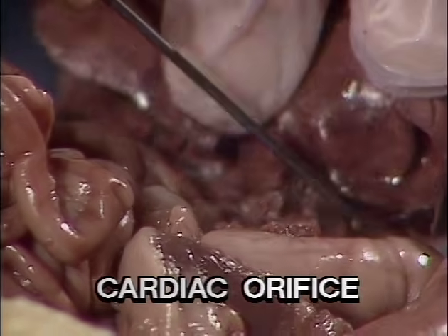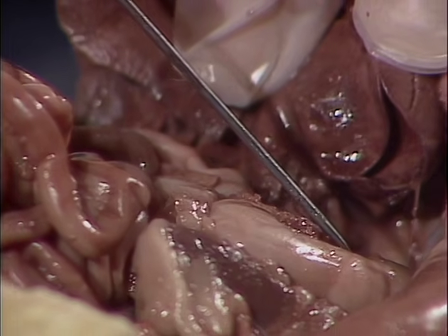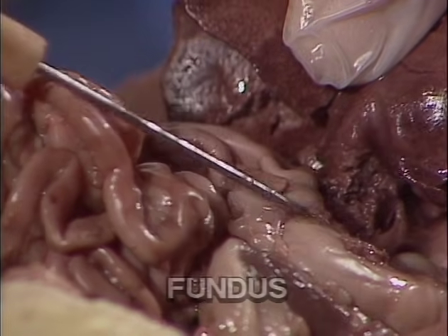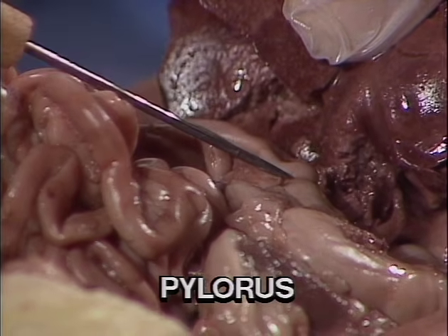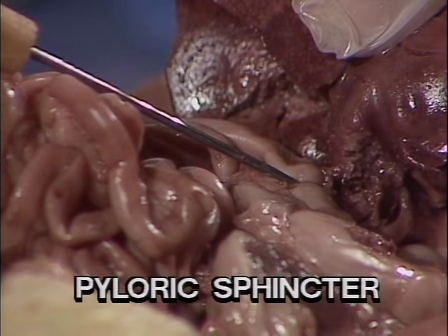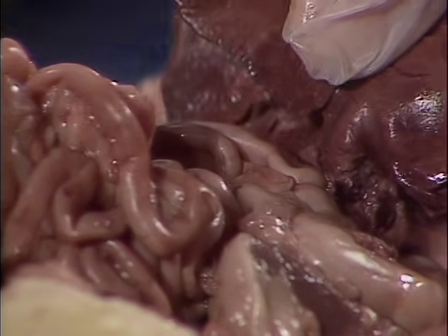The first section of the stomach is known as the cardiac. There is a ridge separating the cardiac stomach from the main body of the stomach known as the fundus. The lower portion of the stomach is known as the pylorus. At the terminal end, we see a ring of muscle known as the pyloric sphincter. It controls the movement of food from the stomach into the long coiled intestine.